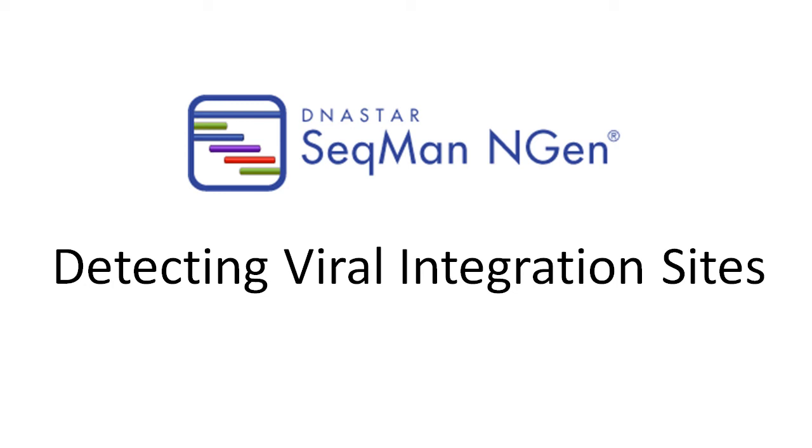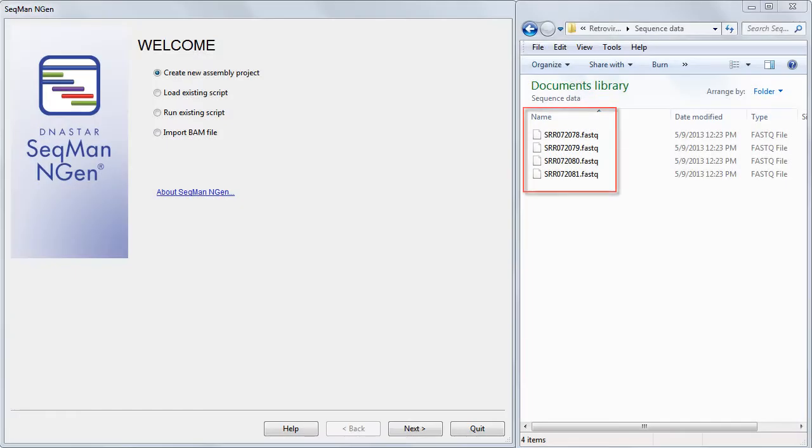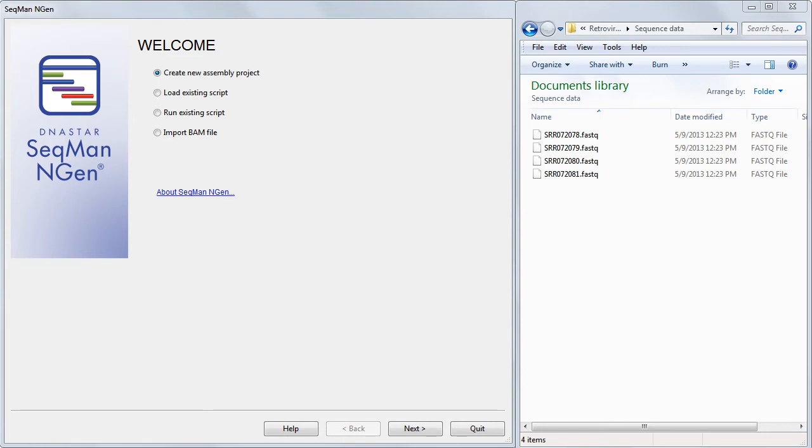SeqMan NGen's viral host integration workflow can be used to detect locations where retroviruses are inserted into a host genome. In this video, our data consists of four FASTQ data files from the Short Read Archive. This came from a gene therapy experiment in which a retrovirus vector expressing the HSVTK suicide gene was introduced into human lymphocytes.